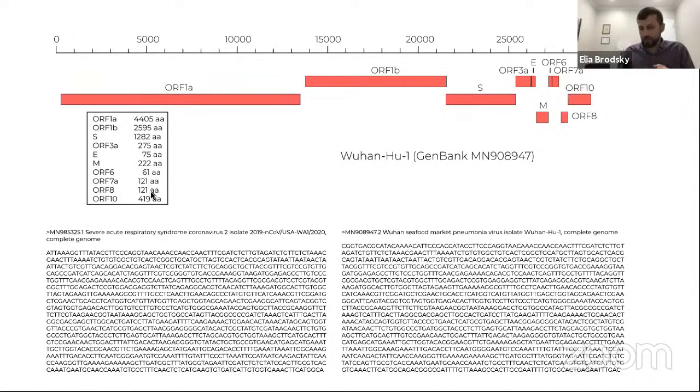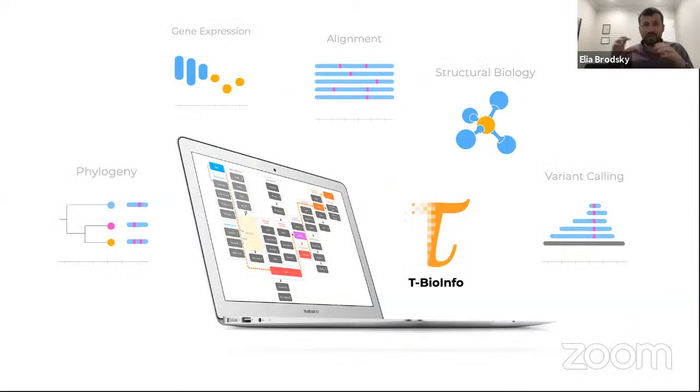So then we can start asking different questions about how they are related to each other and what that could mean functionally. To give you an insight into all of this practically, we have this multi-omics platform that we will use in this program. In the program, we will not only speak about these examples, we'll actually do these examples together. When we talk about the specific samples or sequences and how they relate together, we will do some analysis.